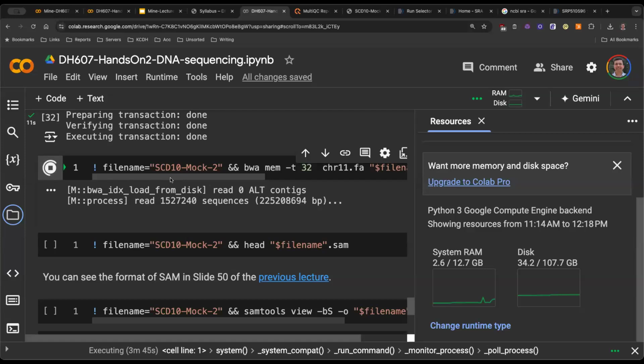While this is happening, any other questions? Any other questions where you think I sped through or was not clear, or you have absolutely no idea what's happening? Just, let's look at the RAM right now. Look at the RAM. What do you think happened? 2.4 to 6.4 directly.